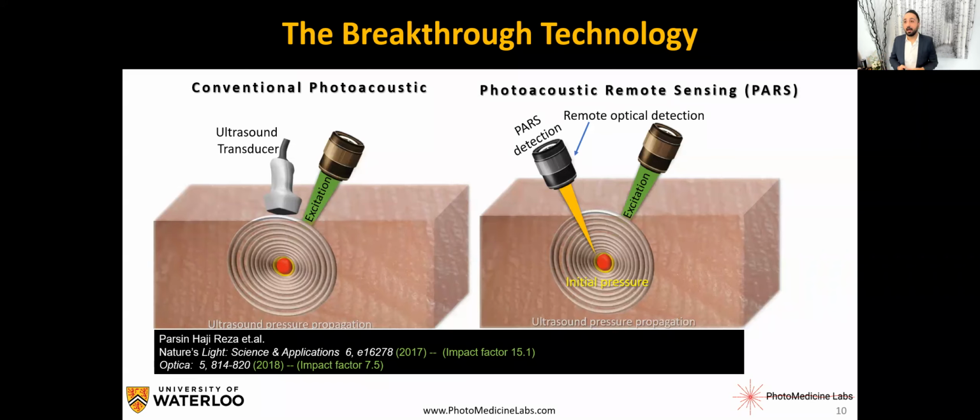Roger Zem's lab, I think it was the third year of my PhD, I was working on a very different project, and all these years I always like to test different things that usually never work and don't make sense. So accidentally, during one of those tests, when I was bored with the experiment, I realized that the ultrasound transducer I was designing at that time, when it was not even on the sample, I still could see some level of signal. It was very weak, really looked like noise, but meant something to me at that moment.